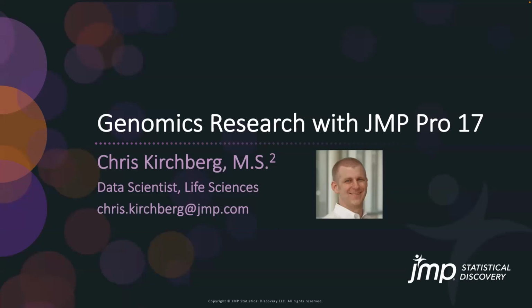And this is a good topic with JMP Pro 17 having just come out this past October 2022, and JMP Pro kind of changing the way that genomics analysis is done using JMP tools, whereas before it was in the separate JMP Genomics platform. We now are introducing tools and enhancements to existing platforms in JMP Pro to handle genomics data.